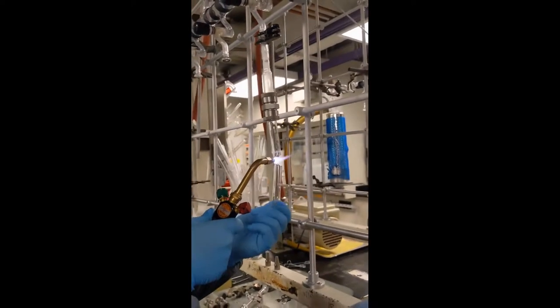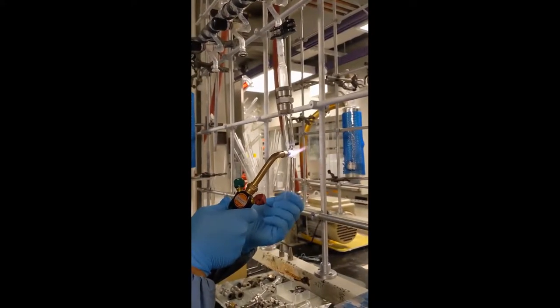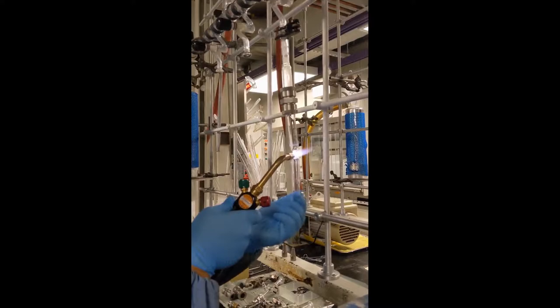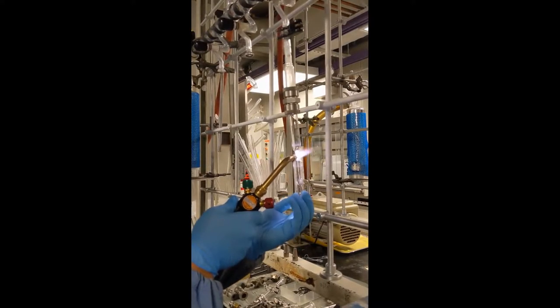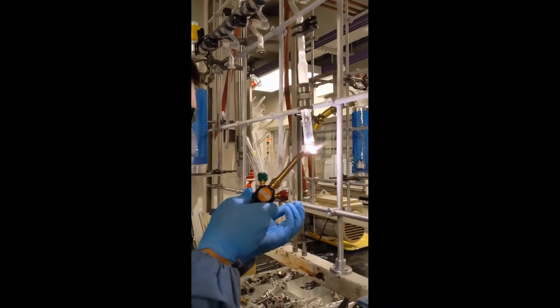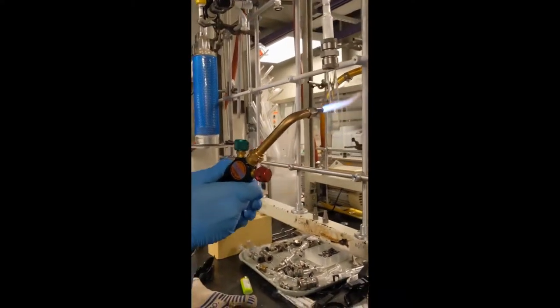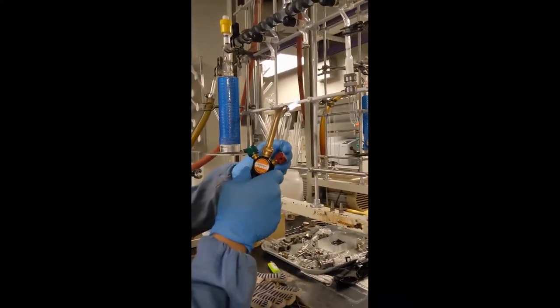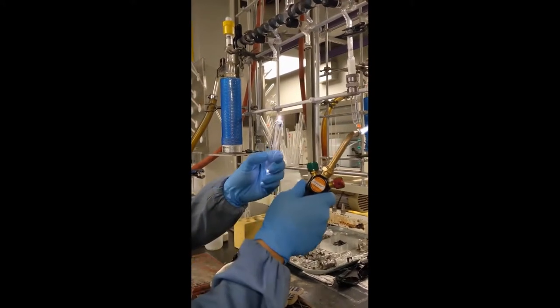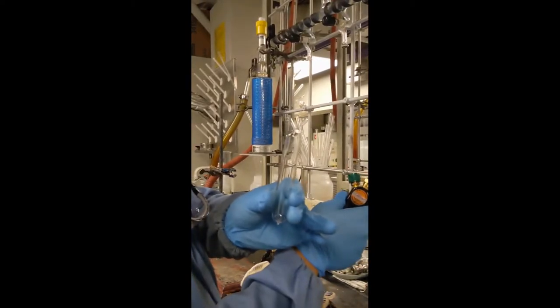At this point, the tube's already sealed, so I just need to get it to come off. Right — presto. Finish off the top of the tube, and we're done.